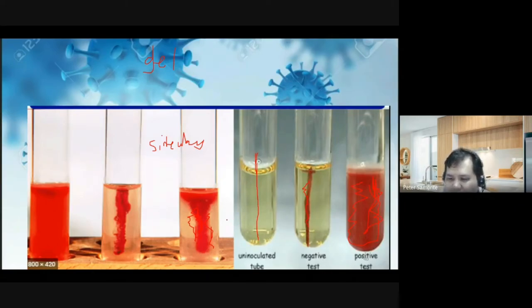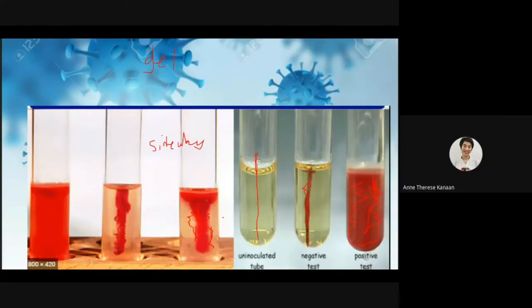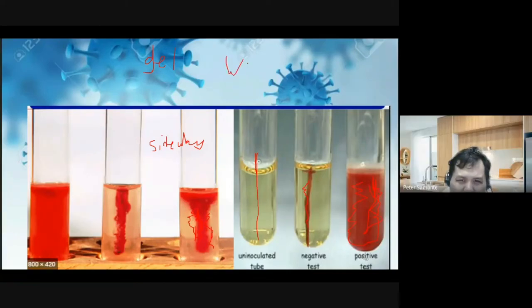Any questions? Okay, then I have one. Yes, Bob. What do you use to puncture, sir? Di ba meron tayong wire needle? So, di ba may wire loop? So, we have your wire needle class. You would dip that to the specimen, tapos stab mo na siya.